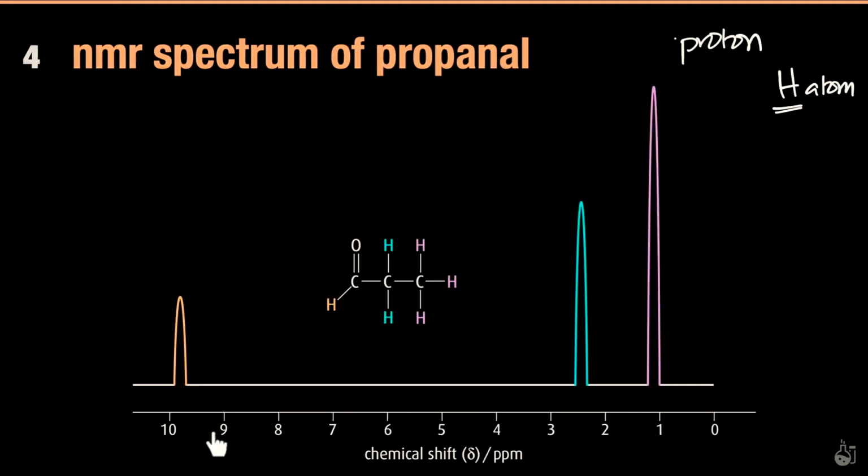Obviously, we'll talk about the x-axis values later. We'll talk about why the peak is higher and lower also. But this is a summary first, and then the detail. So, first of all, there are 3 different environments, telling me that there are 3 different types of hydrogens in the environment. If you look, you might see that these 3 are considered to be the same environment.